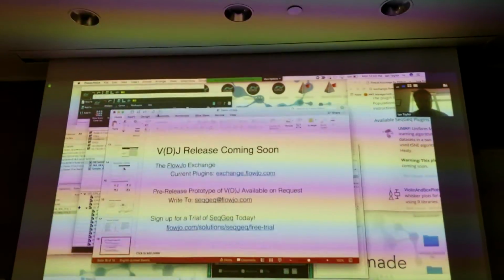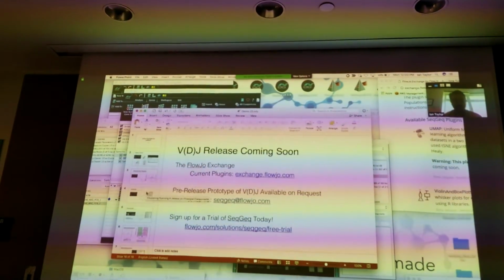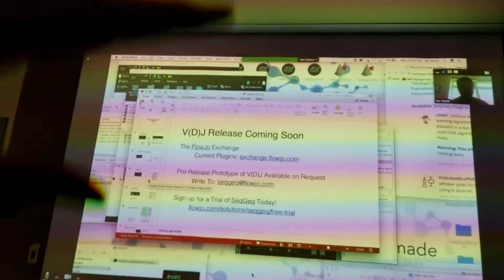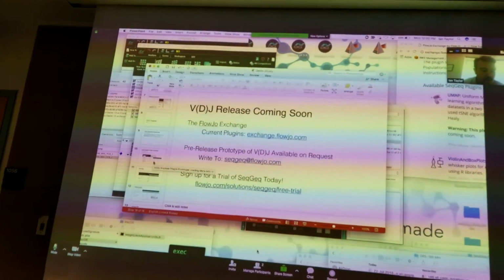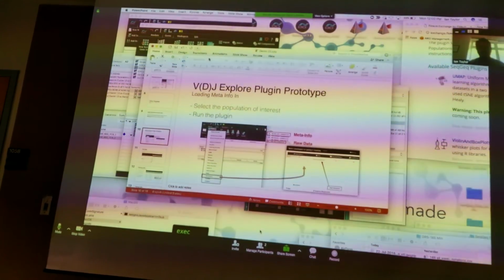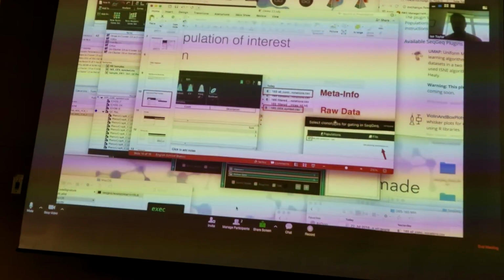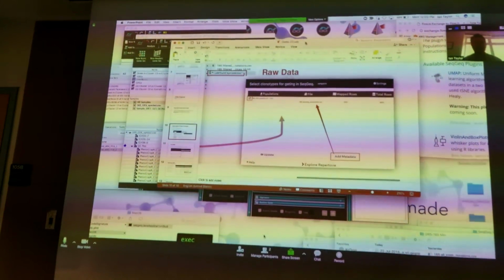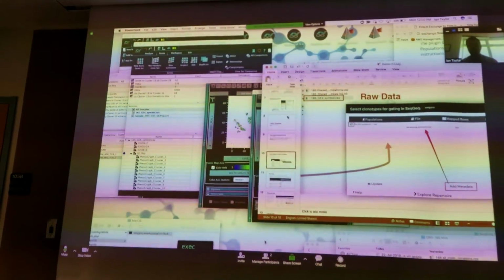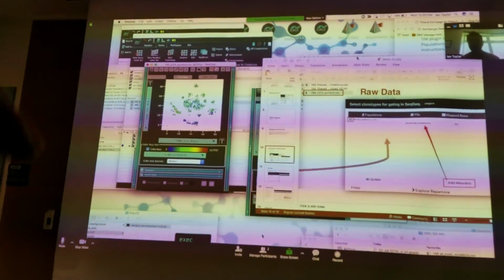It's hard to see. Some of them are sprinkled in with other ones, you know what I mean. I'm looking at the B cells, and the green was sort of in the upper left, or in the left side, but I don't know whether it's possible. There could be some CD8 sneaking in that has some interferon response. Is it possible just to get that set that expressed one or more of those genes, and then look at those versus ones that don't have, like the green versus the blue in the upper part?